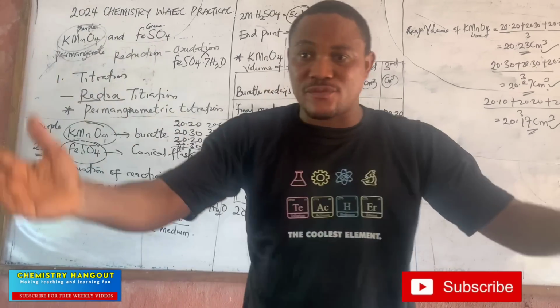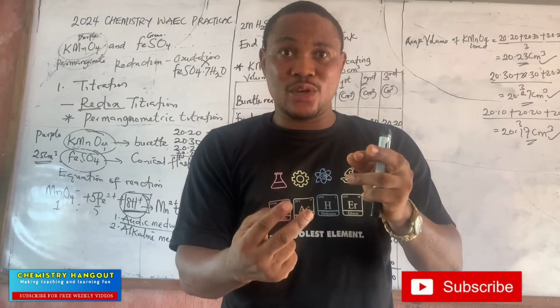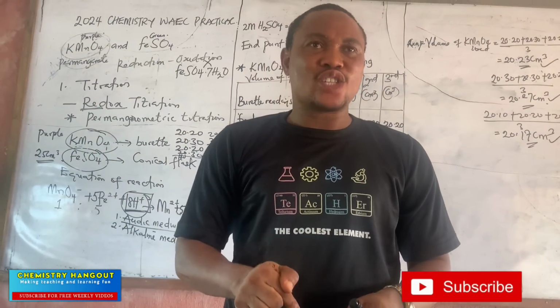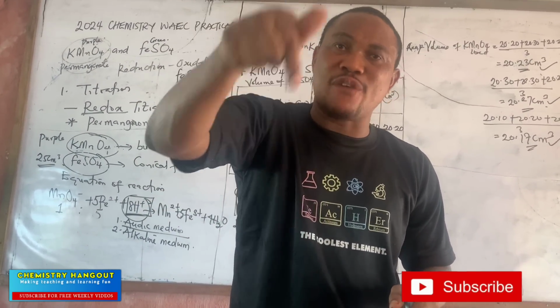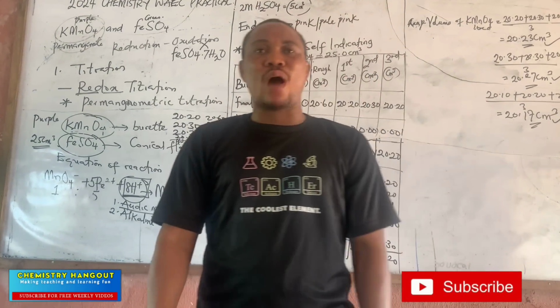That's how I carry out my practical. I do it in the presence of the students. They will be gathered. I carry out the titration in front of them so that they will see it, and I will get my titre value. Then I'll tell them to do it. So there is no way they are not going to get a titre value similar to my own on that day, even if I am not exposing them to my titre value. I don't know if you are getting that. So please, let's do our work, please.